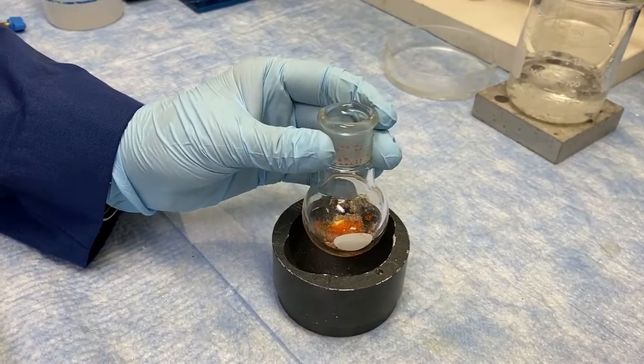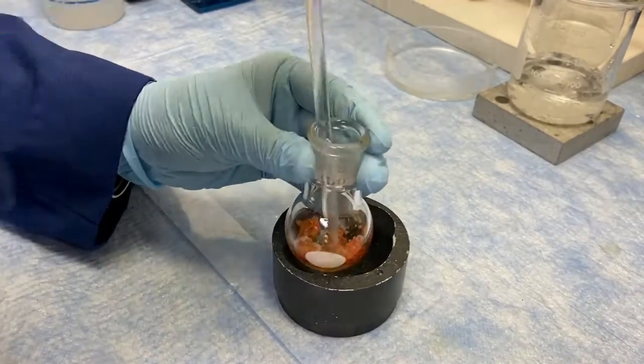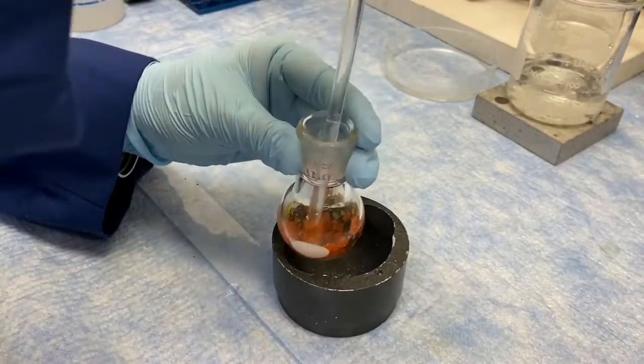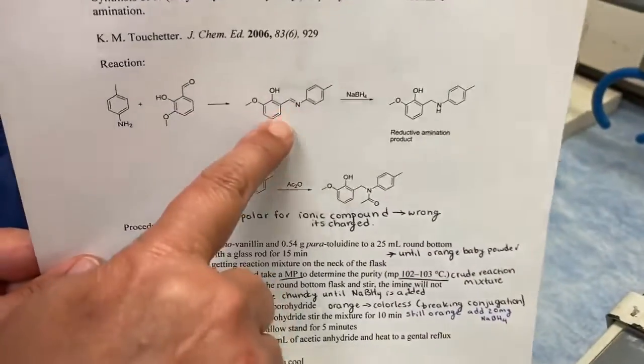And so what's going to happen here is Karen's going to go ahead and stir this up for us, and we're going to see this orange color appear. This orange color is the imine that is being formed by the corresponding reaction. So that's this guy right here.